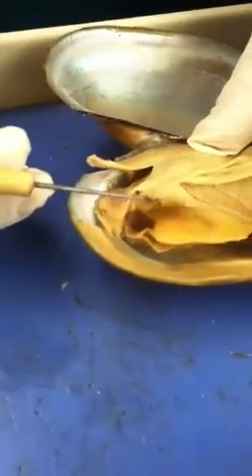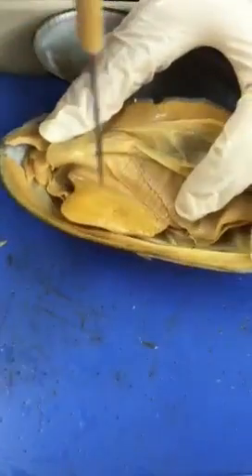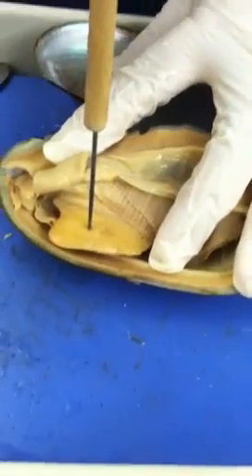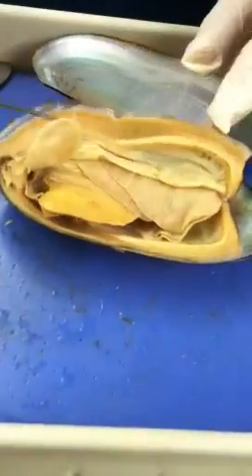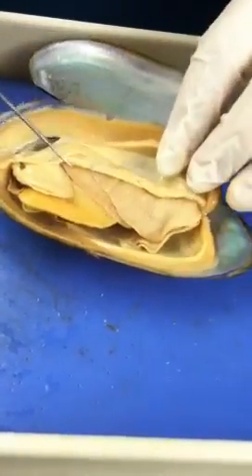Beneath the labial palps, there's a structure that when you touch it, it's kind of hard — that's actually a muscular structure called the foot. They just have one foot. So that's the labial palps, gills, and the foot.